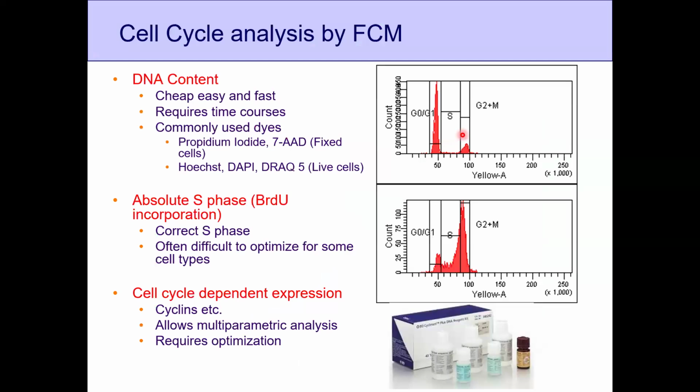But cell cycle analysis is very important for pharma companies. Whenever pharma companies go for drug discovery, they look at drugs which affect the cell cycle. You must have heard about a few drugs. Colchicine is one example. It arrests the cells at M phase, so you'll get a lot of G2/M phase.